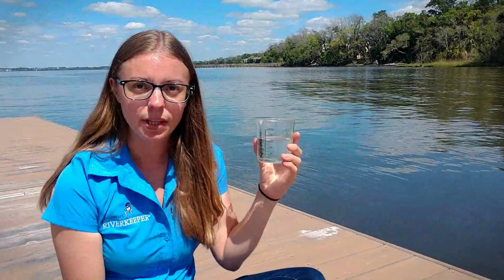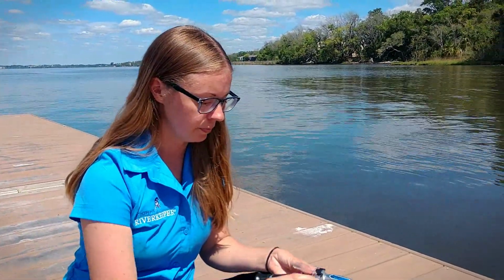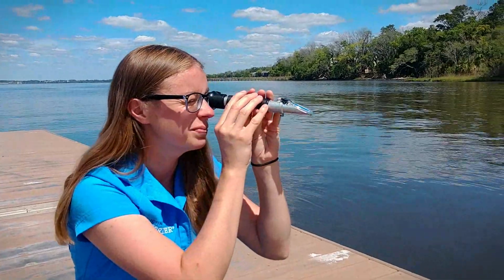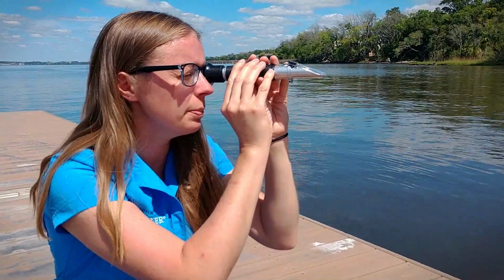Test your hypothesis. I took a sample about 15 miles south of where we are, which is further away from the ocean, and we're going to read how much salinity is at that location. So I'm reading about 5 ppt. So did the salinity increase or decrease as we moved away from the ocean? And was your hypothesis correct? If your hypothesis wasn't supported, go back and review and figure out why.